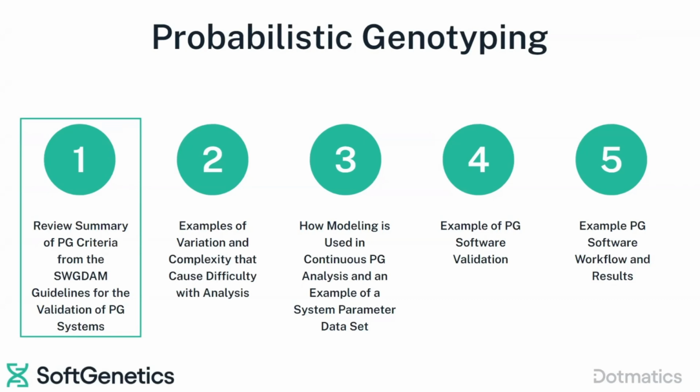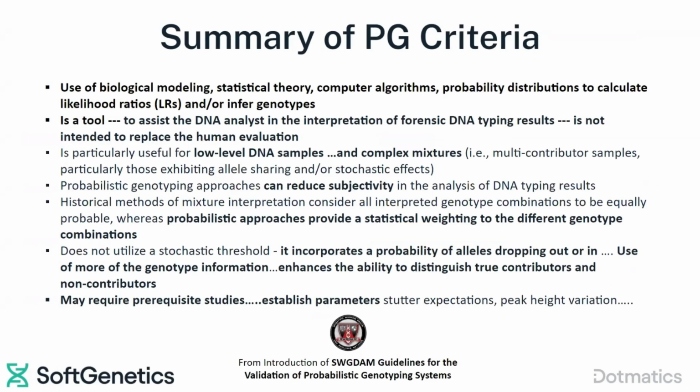In section 4, we'll have a presentation on validation of PG software. And in section 5, we'll have examples of PG software workflow and results. So, a summary of the PG criteria. All of these are taken from the SWGDAM guidelines.